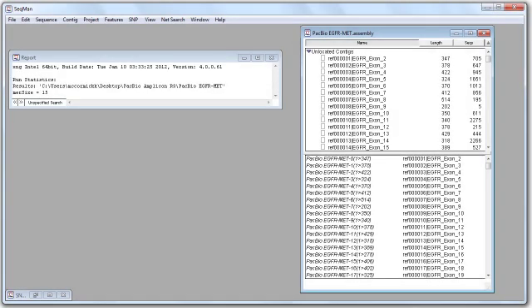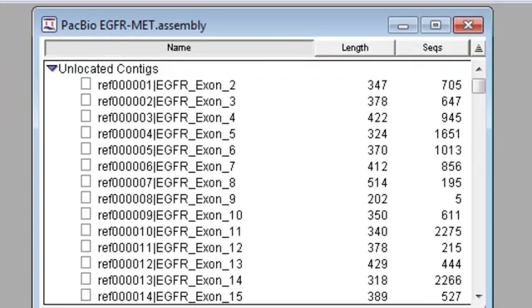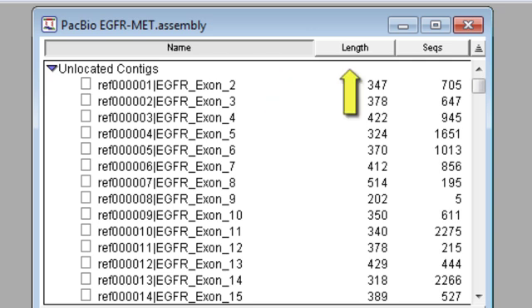Now I have my finished assembly open in SeqMan Pro, and the first thing I see is the Project Summary window, which contains a list of all the contigs assembled in my project. I can sort this list by name, contig length, and number of sequences in the contig.